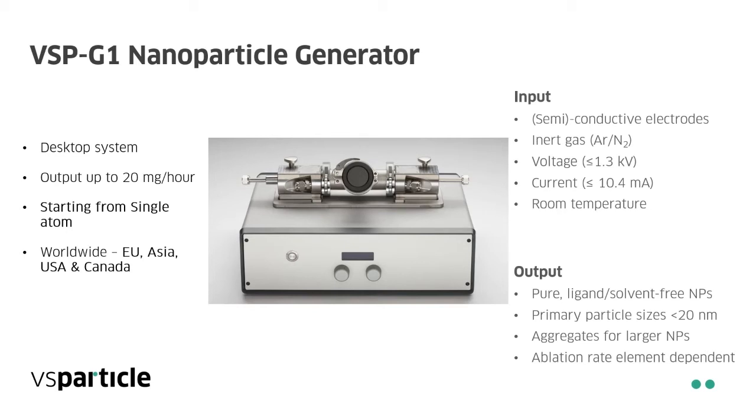And it works at room temperature, both on the outside and effectively on the inside. The gas will warm up a bit, but everything is basically, you can touch it when it's running at full power and not burn yourself. So it's a cool technique in that sense. What comes out is an aerosol of pure, ligand- and solvent-free nanoparticles. The primary particle sizes are basically always below 20 nanometers. We tend to have aggregates, of course, if we start growing bigger particles or if you start giving these aerosols too much time to grow. And the ablation rate is element dependent, and I'll come back to that later.